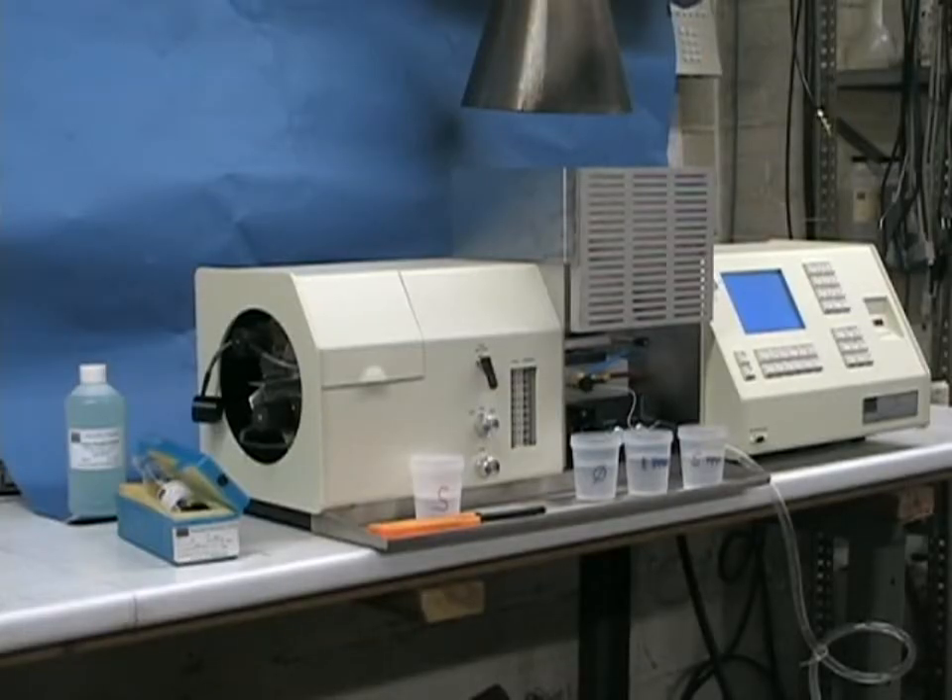This is the Buck Scientific Model 210 Atomic Absorption Spectrometer System. This chassis is used for several products, and we will demonstrate how simple and easy it is to use, and the high quality of the data you can obtain from it.